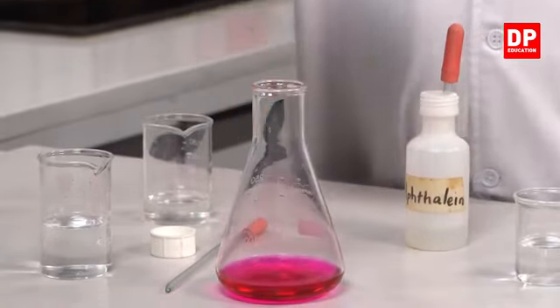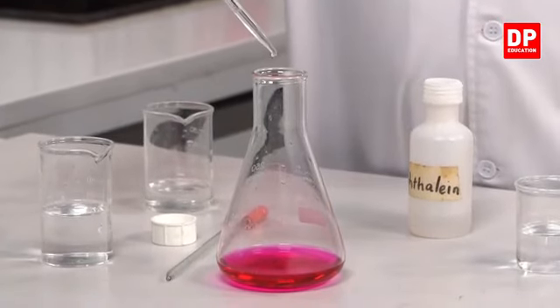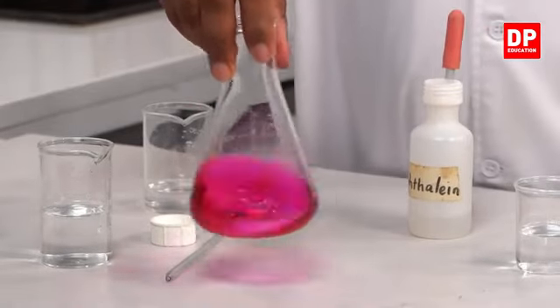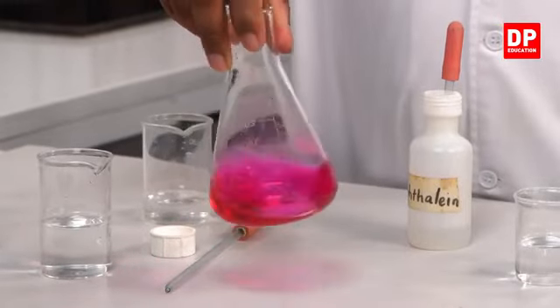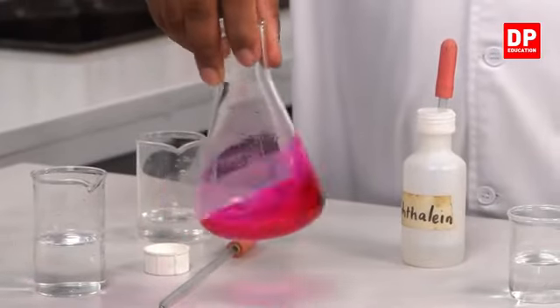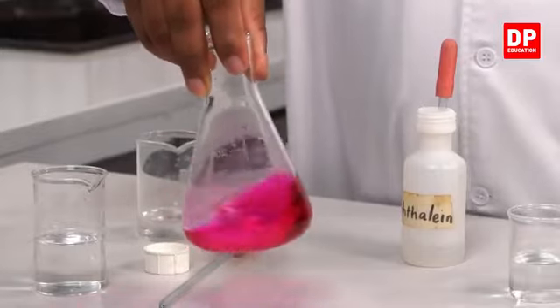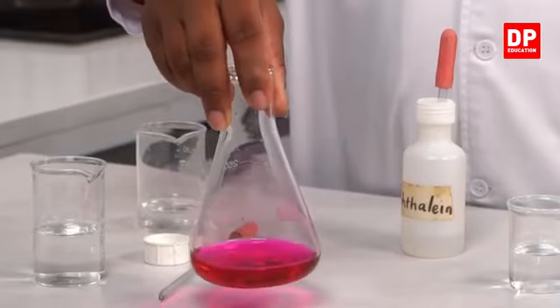So I'll add another drop. See, phenolphthalein is giving a good pink color with the presence of a base. So it's giving a good pink color with sodium hydroxide.